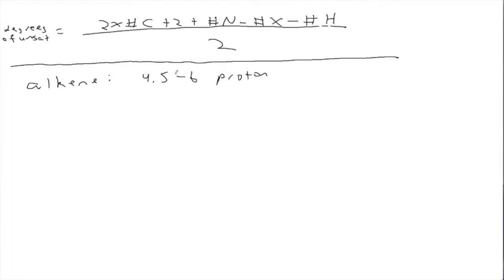Remember, we want to determine the type of functional group, so we want to focus on the most distinctive peaks that can only mean one thing. If you look at that handout, you'll see that the 5 to 6 region is pretty much exclusively alkenes. That gives you a much better sense for when you have an alkene in the compound.